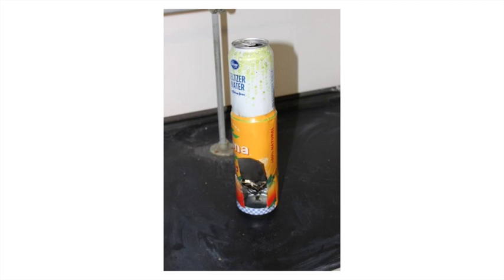To start the experiment, the weight of the piece of food was taken and recorded. Then the food is placed in the bottom of the can on a small grill. Next, 60 milliliters of water are weighed and poured into the top of the can. The initial temperature of the water is taken and the food is set on fire. Once the food is completely burned, the water temperature must be immediately recorded for accurate results.